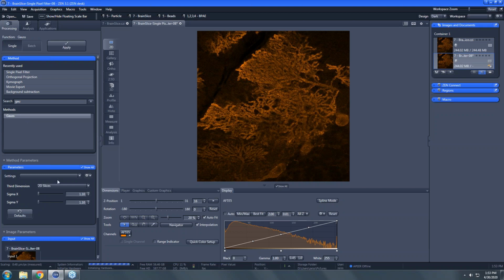A Gauss filter is a smoothing filter, and what we're doing here is looking at a small neighborhood and modifying the local intensities so that they're all a little bit closer to what their neighbors are. The result is that we get much less noise in the image. Of course, the opposite of smooth is resolution, more or less. If we're smoothing things out, we're losing resolution.